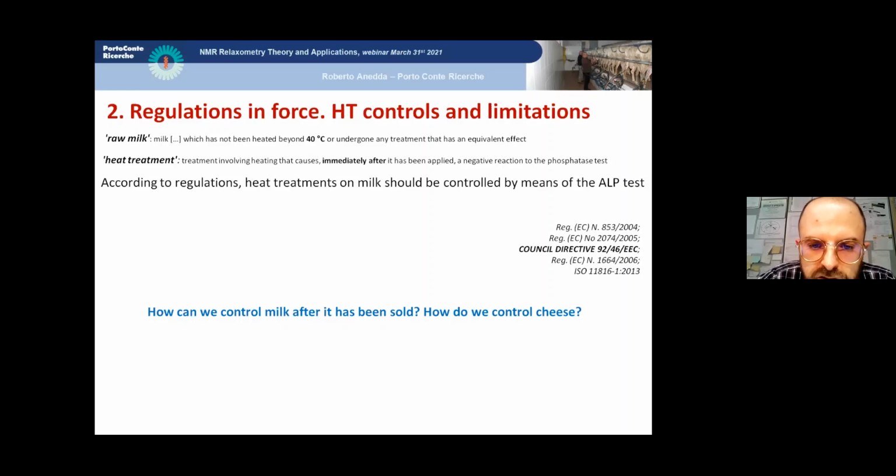And these effects are somewhat transferred to cheese, to other dairy products, yogurt, ice cream, butter, just to make few examples. Many thermal treatments on milk are in fact exploited in cheese making in order to confer particular and peculiar characteristics to the final products, and that go well beyond the application of heat to kill pathogens. In fact, heat treatments have multiple technological effects too.